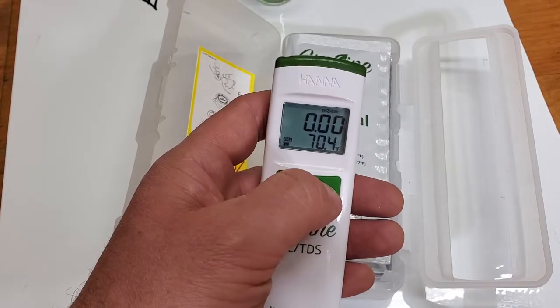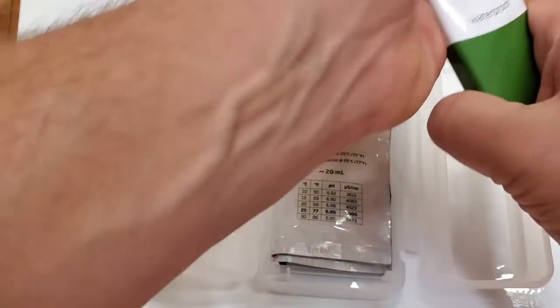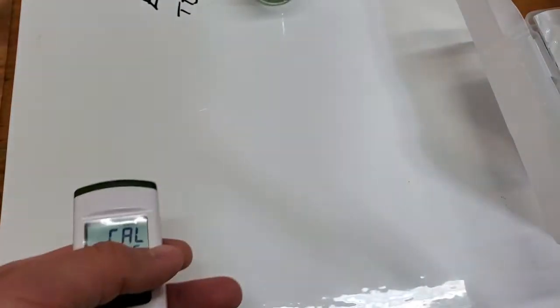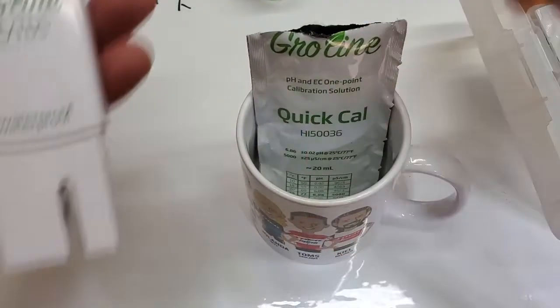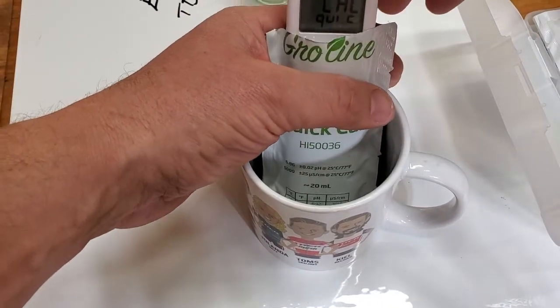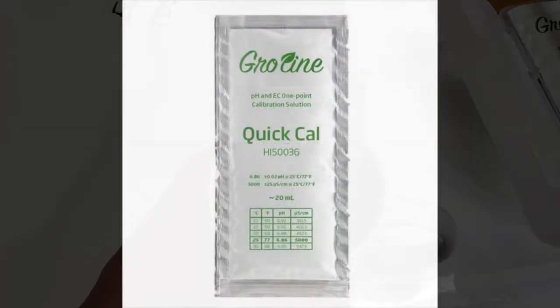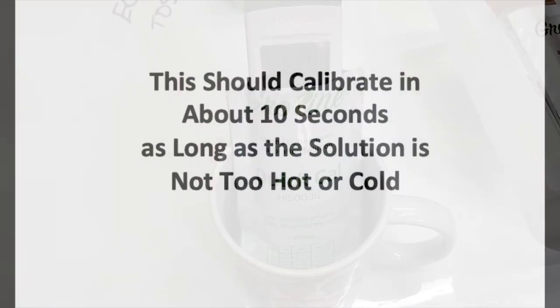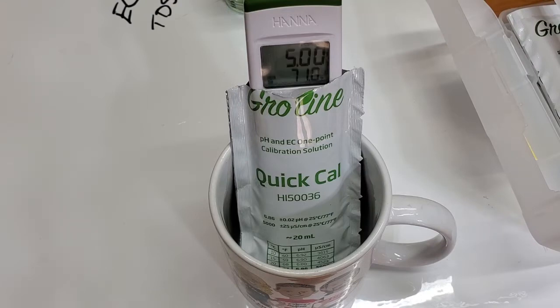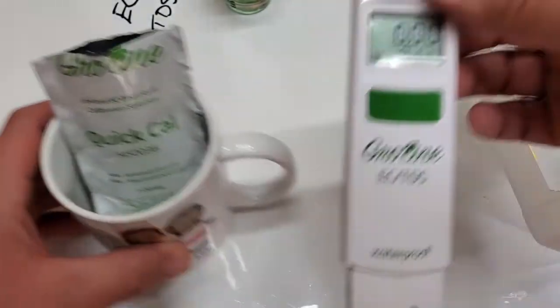So that's the menu. To calibrate it, just hold down cal — we're set up for quick cal. I've got my quick cal here that I've been using for other ones. We're just going to drop this in there. It stores it. It's all set. It doesn't get much easier than that.